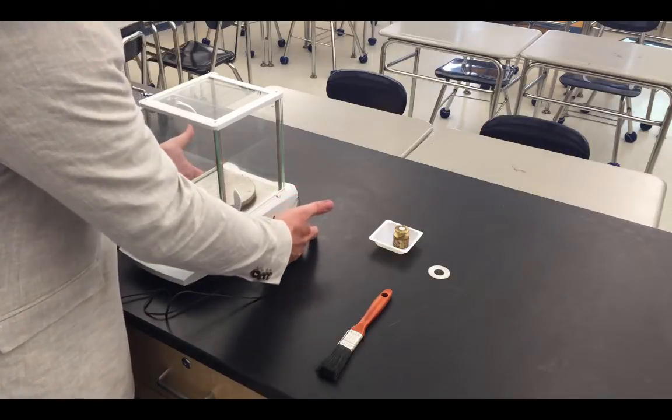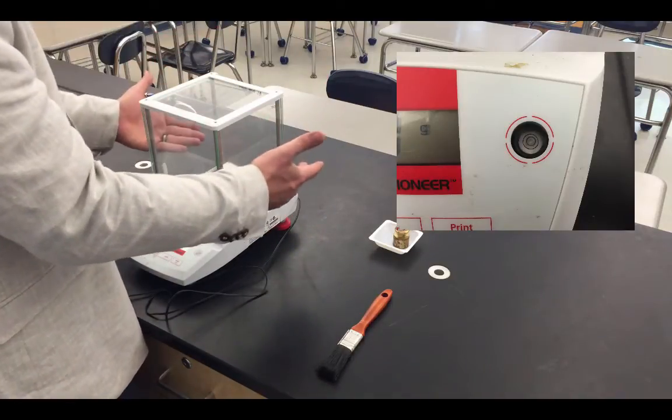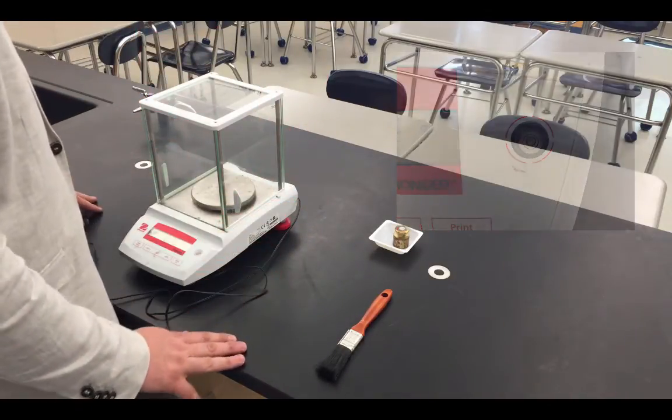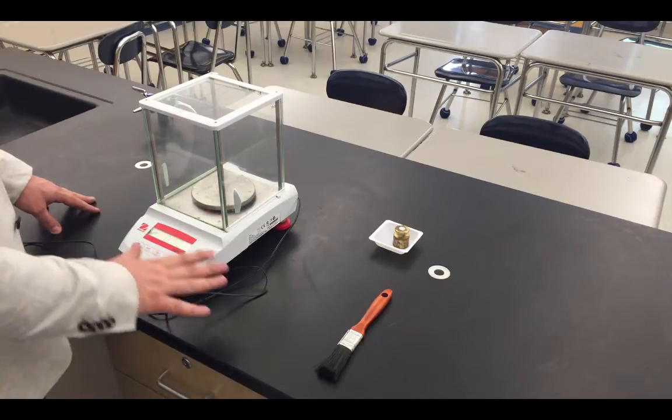To adjust whether or not the balance is level, we can turn the feet towards the back of the balance, which raises up the different sides of the balance until the balance is properly leveled. Once it's leveled, we'll hit the tear button one more time and that'll get us back to 0.00.